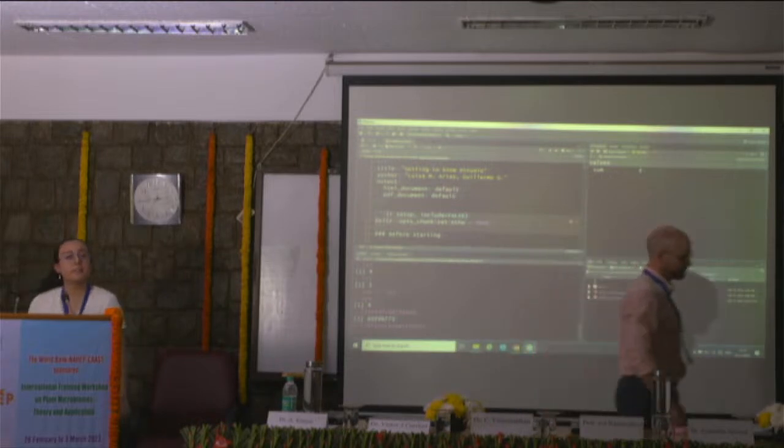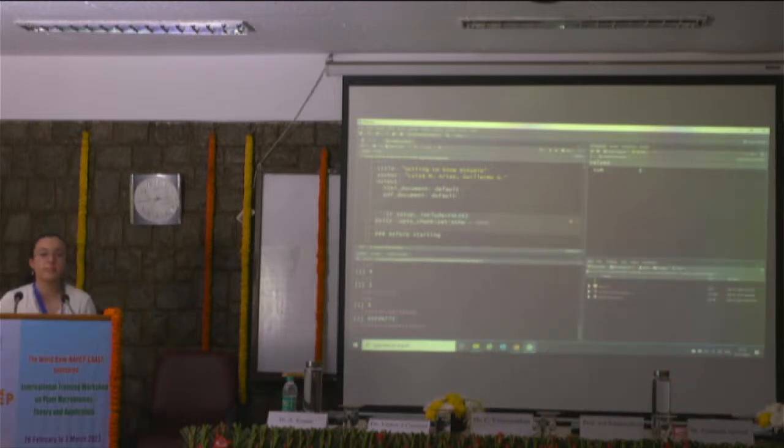Okay, so this is my notebook. This is the notebook I made for this exercise, and that is why it's in source. As I told you before, we're going to be running everything in one folder, right? So we should make sure that the session we have right now is in that folder, the folder you just created with the 2 files. How do we do that?